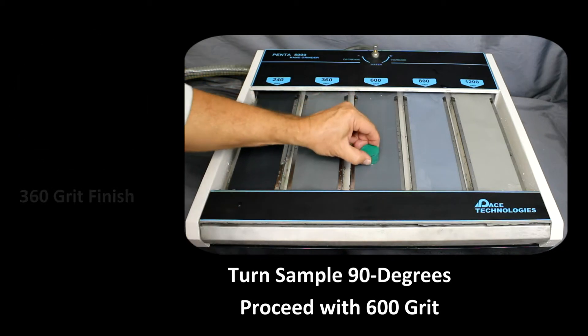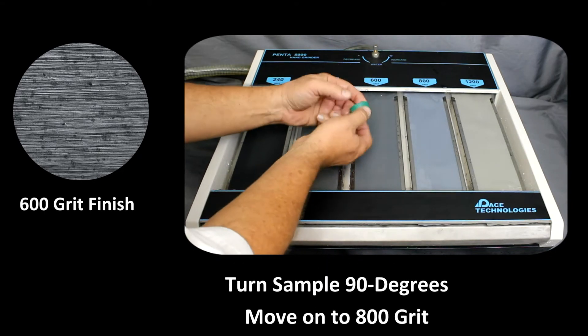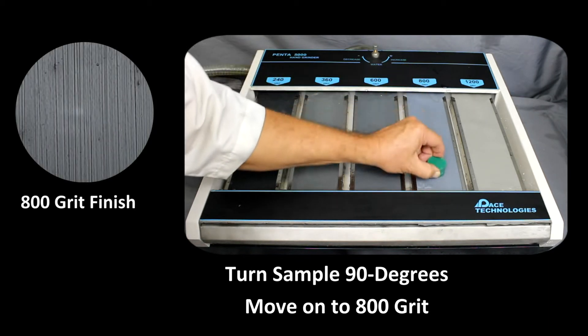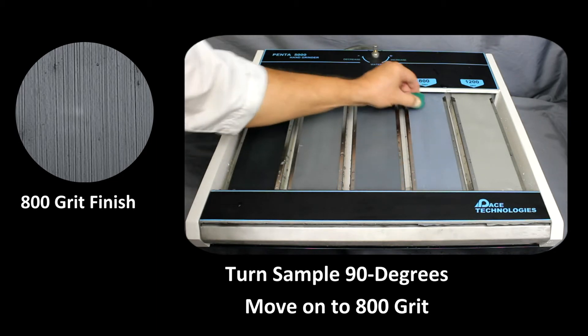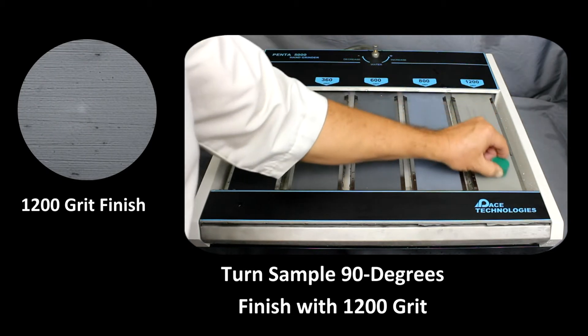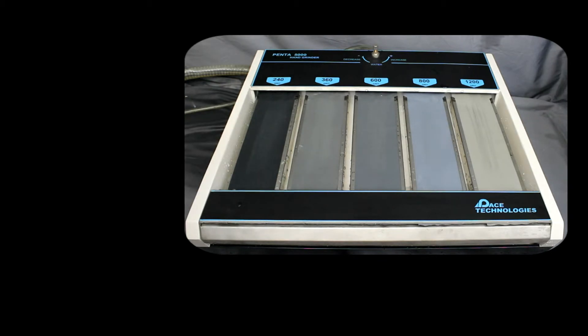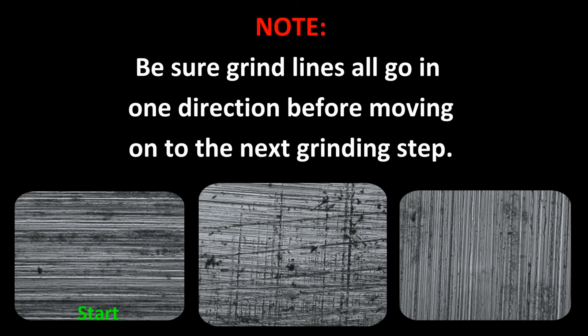Continue the procedure with the 600, 800, and 1200 grinding steps respectively. It is important that all the damage from the previous step be removed before continuing on to the next smaller abrasive size. The best way to ensure that the grinding step has been completed is to visually inspect the sample surface. By rotating 90 degrees after each grit size, it is easy to see if the grinding step has been completed by verifying that all the new grinding scratches are oriented in the new direction.